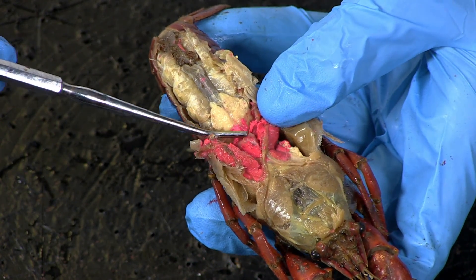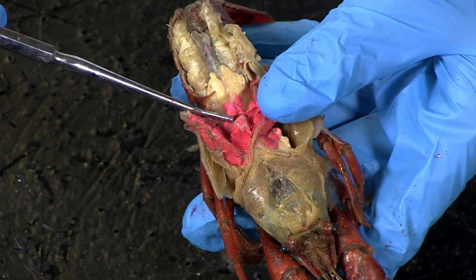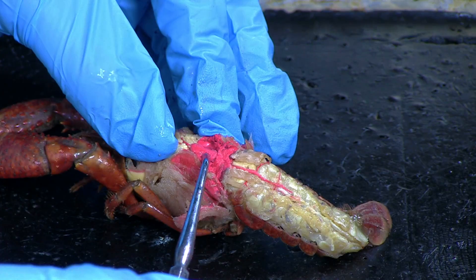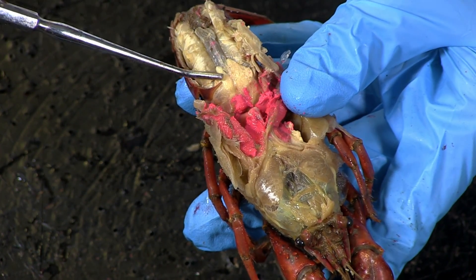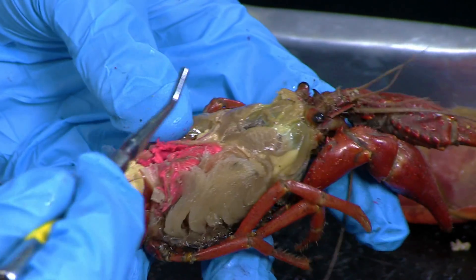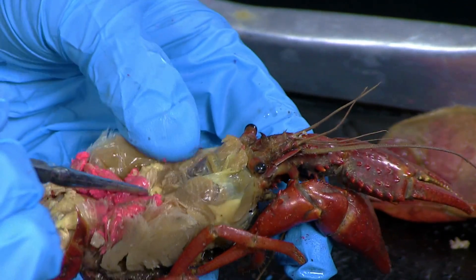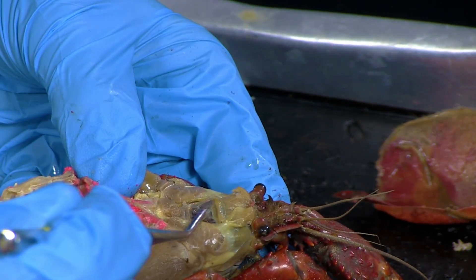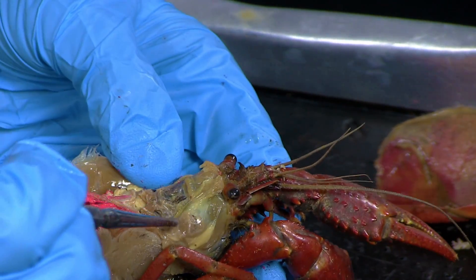Locate the heart, just underneath the carapace and positioned around the posterior portion of the cephalothorax. Take a picture and label the heart. The cream-colored structures beneath and slightly posterior to the heart are the gonads. Locate the stomach in the head region above the mouth. It's large, sac-like, and joins to the intestine. Remove the digestive glands — yellowish-green structures above the gonads — to view this.